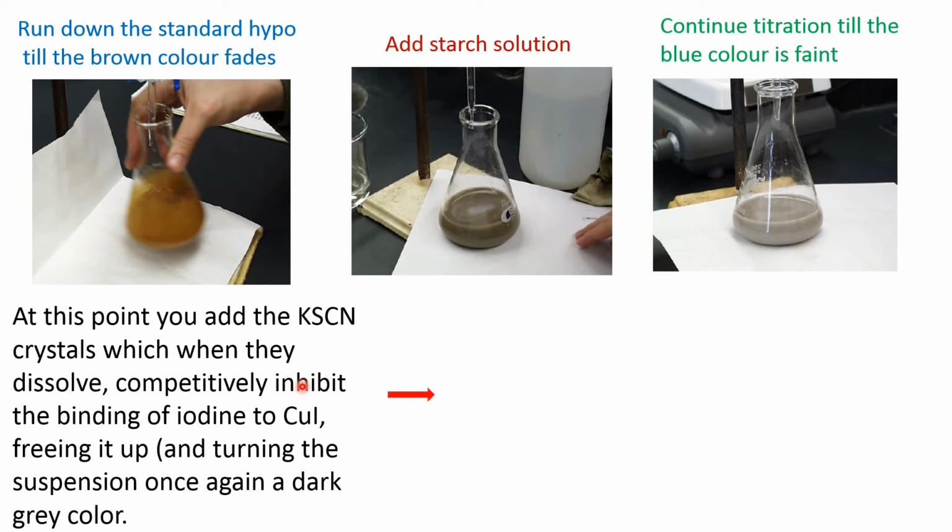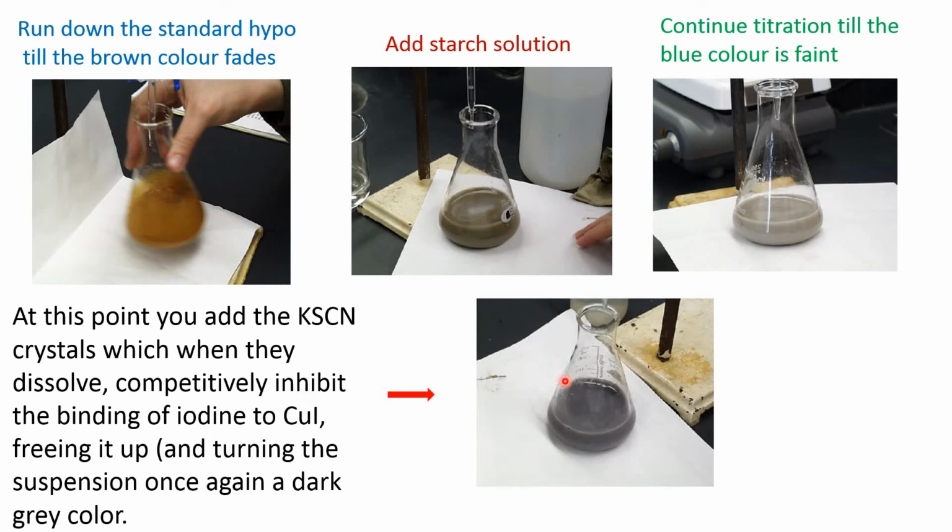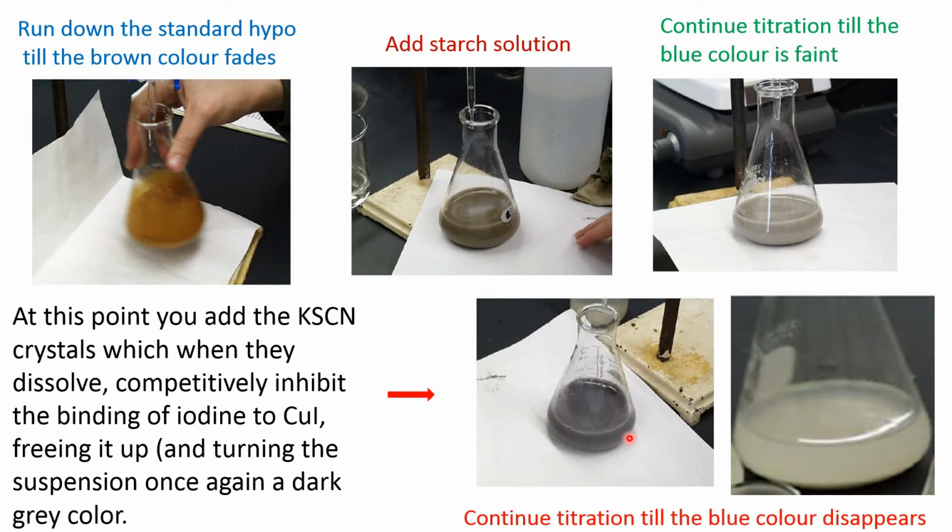Then, when you are adding this one and dissolving that solid substance, what will happen? Adsorbed iodine will be free, and once again the color will become blue-grey or bluish-grey. Now you continue the titration till the blue color disappears. That is the end point.